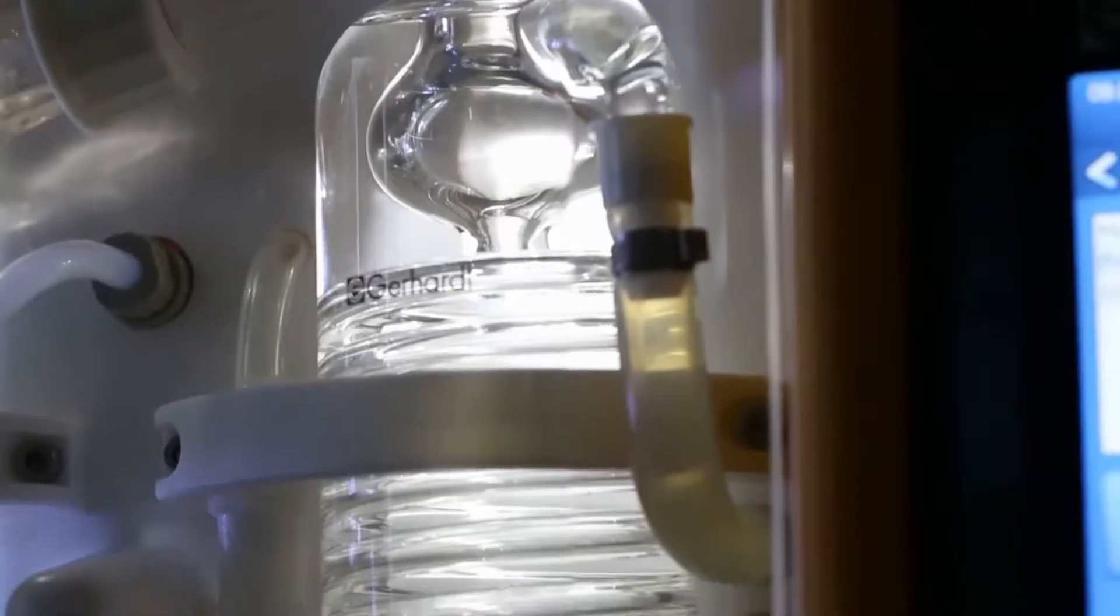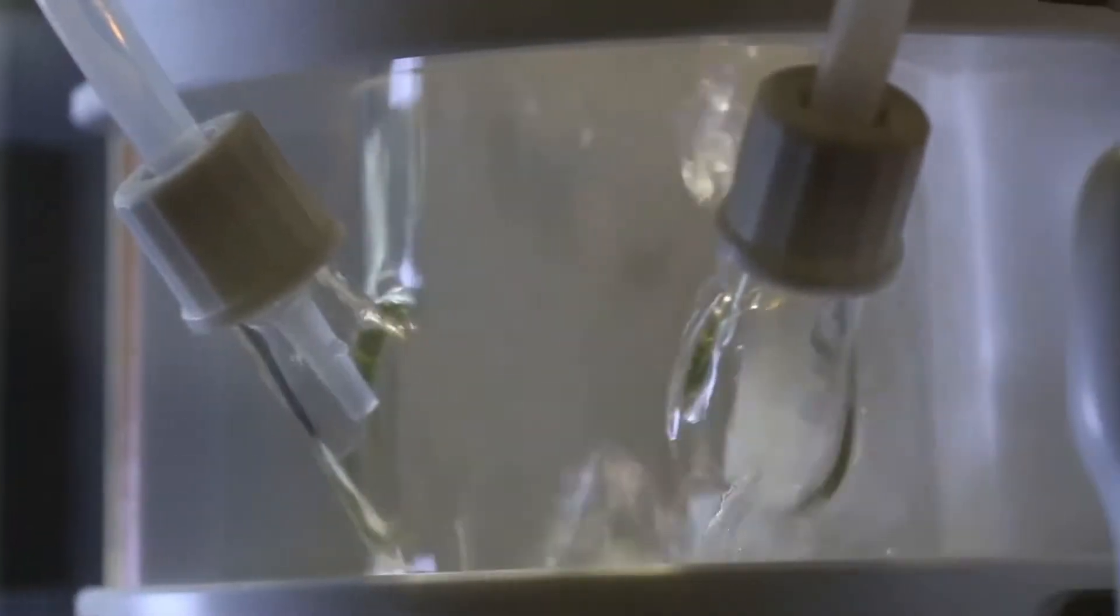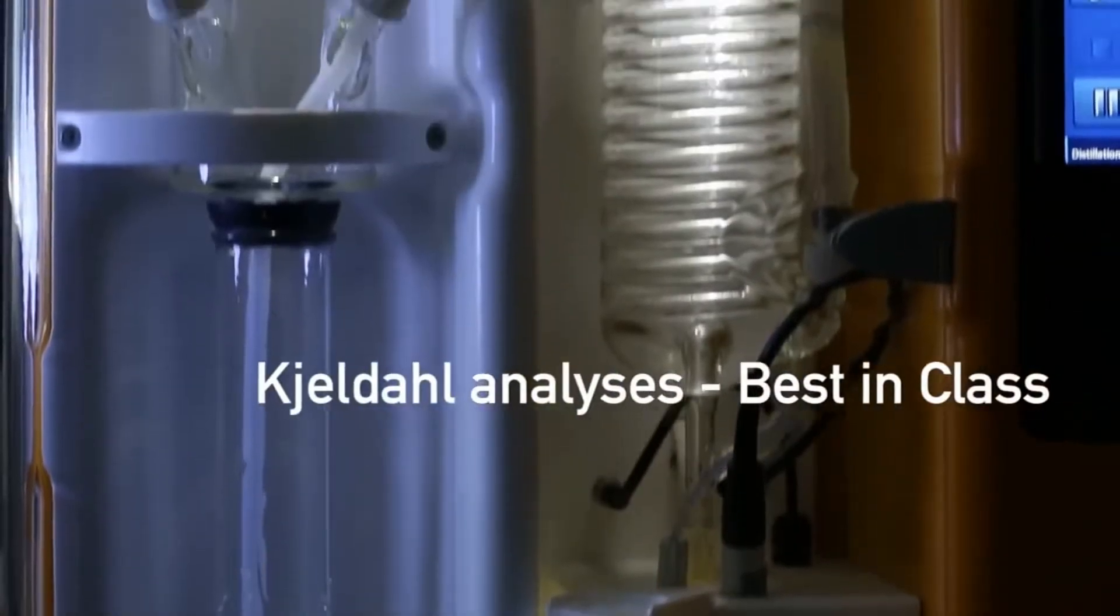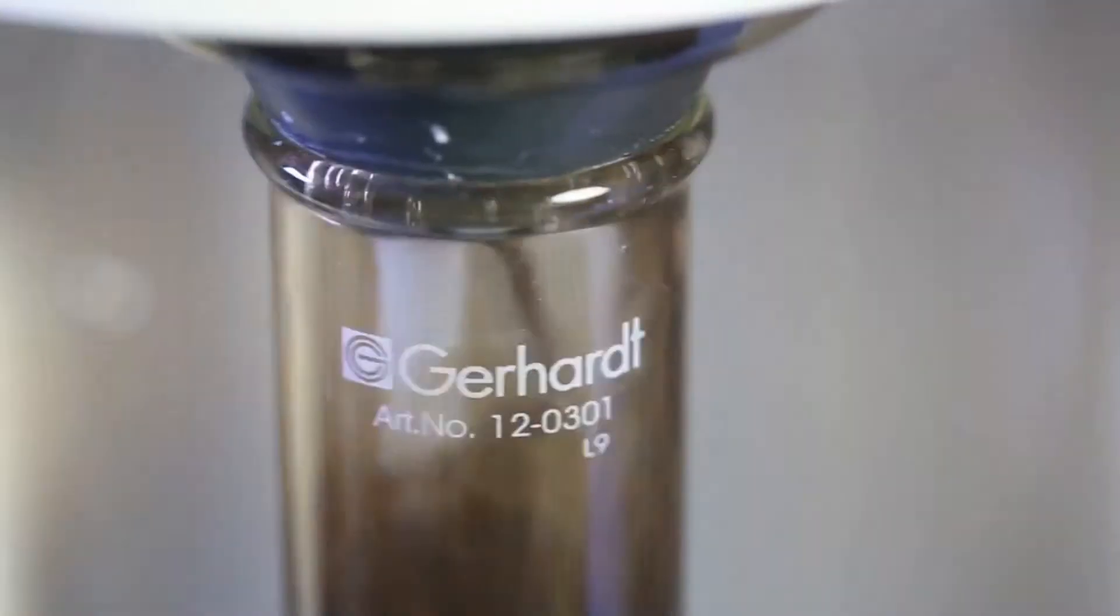In our GAFTA certified laboratory, we spend each day working on making your Kjeldahl analyses even more cost-effective, precise and safe.